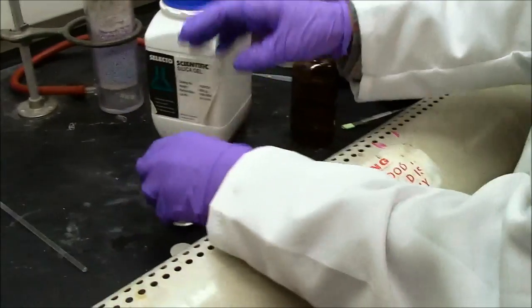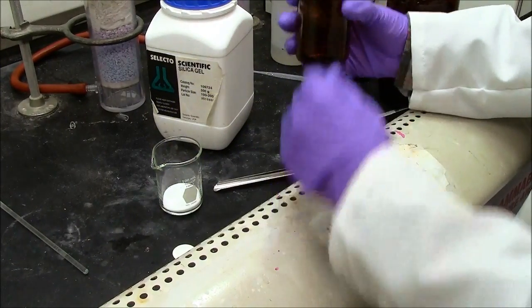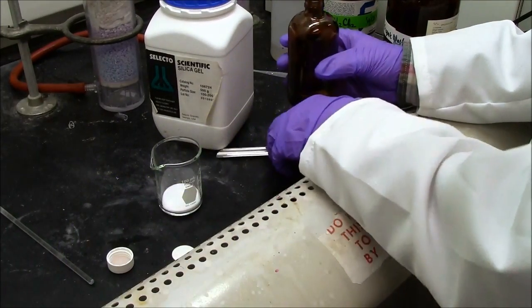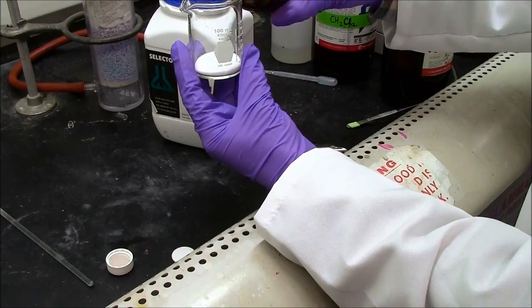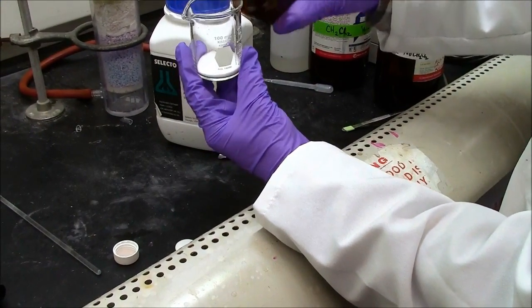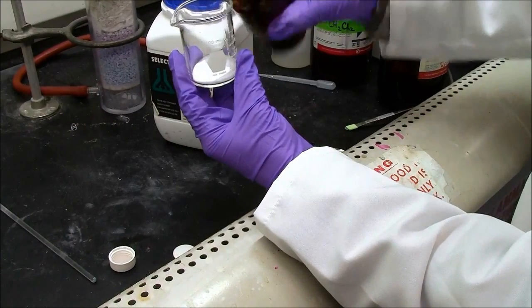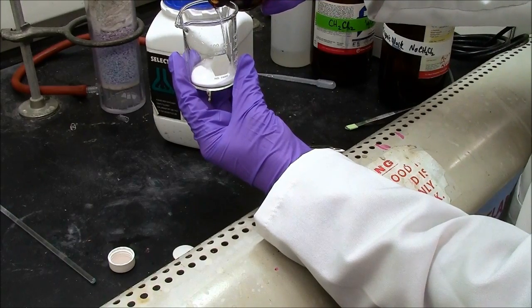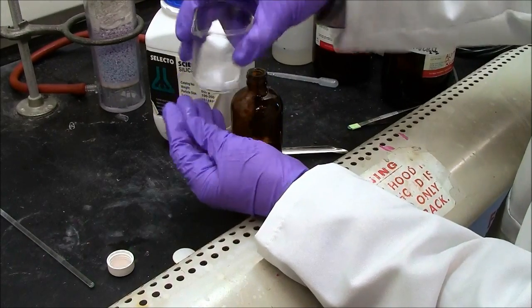We're now going to add the solvent. In this case, it's 80% hexane, 20% ethyl acetate. And we need to add enough so that all the silica will get wet and a little bit of solvent left on top, but not a vast excess of solvent. So, more than that. More than that. Probably more than that, yeah.